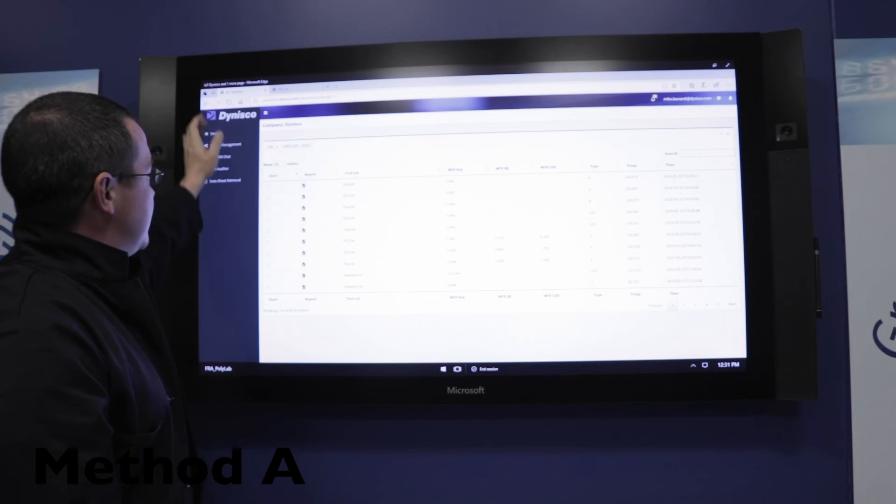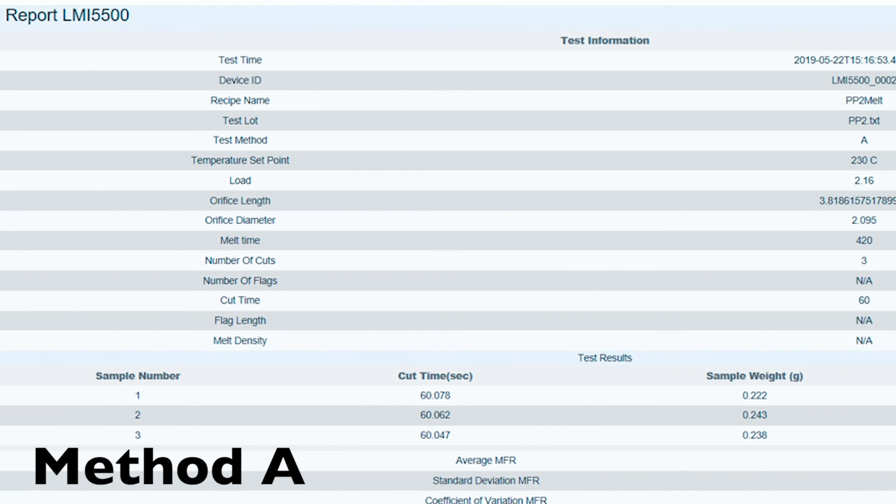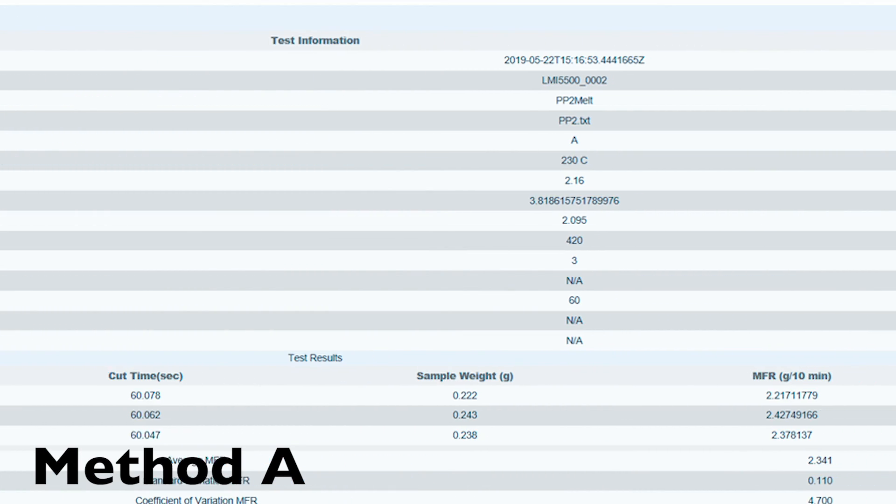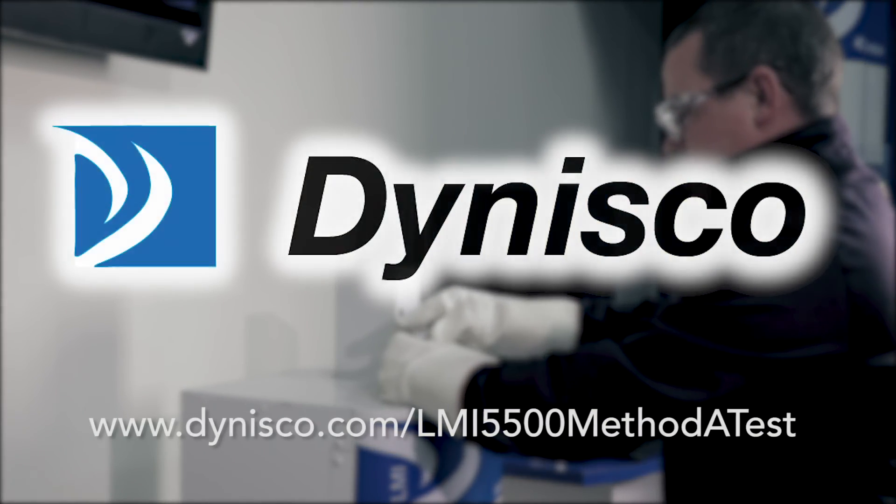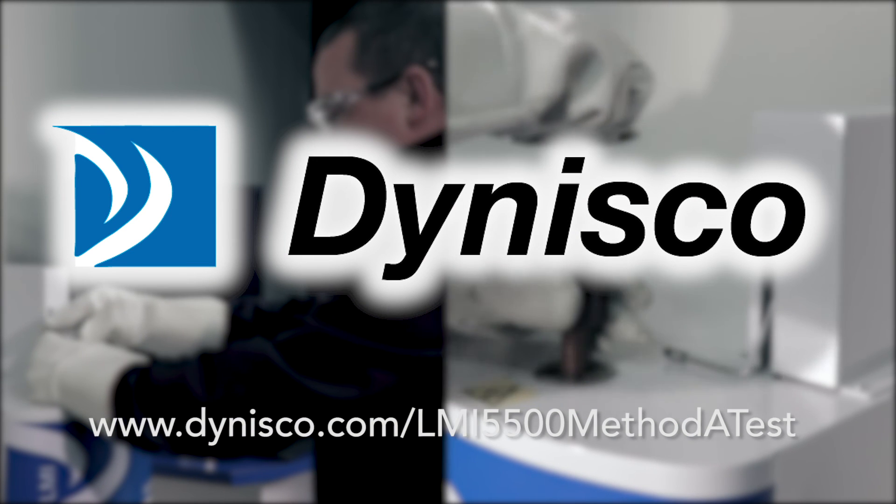Upon test completion, results are viewable and we can send all test results to the cloud. The information obtained from this test is important for achieving a quality product while maintaining a high level of efficiency in production.